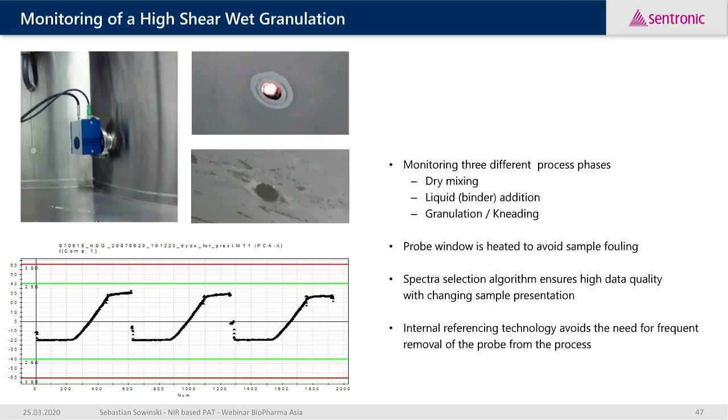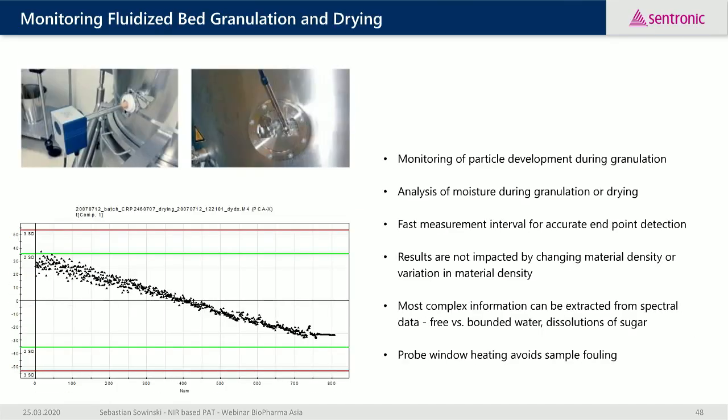As most of you probably know, NIR spectra are affected by physical as well as chemical changes. So NIR can even be used here to have a trend of physical changes, of granule growth, as these change during this unit operation.